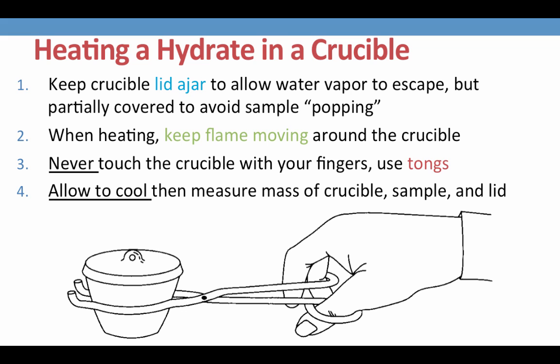When heating your crucible with the Bunsen burner, it is important to keep the flame moving around all the surfaces of the crucible. This will ensure even heating of your sample within the crucible and also avoid burning of the crucible, which can occur if you allow the flame to stay in one spot for too long.